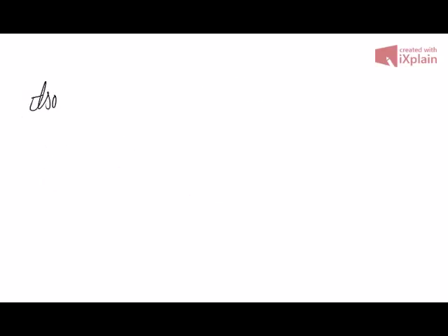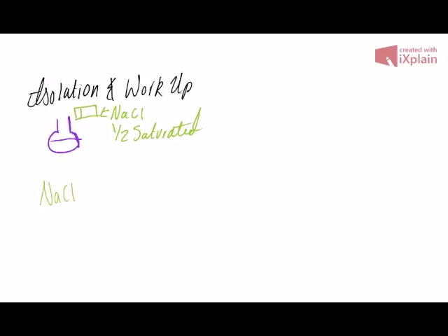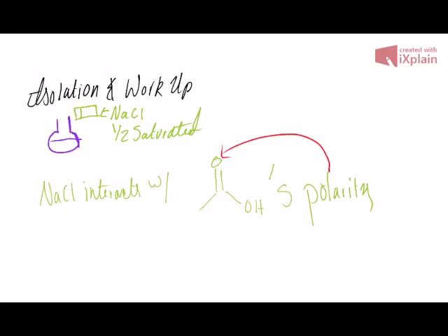After the initial reaction, we added a half-saturated sodium chloride solution to our substance. The sodium chloride interacted with the polarity of the acetic acid. This created a substance that was more energetically favorable to be mixed yet separate from the benzyl acetate. This substance has a higher density than the benzyl acetate and settles to the bottom with a visibly distinguishable result. The bottom layer was then transferred to a waste beaker.